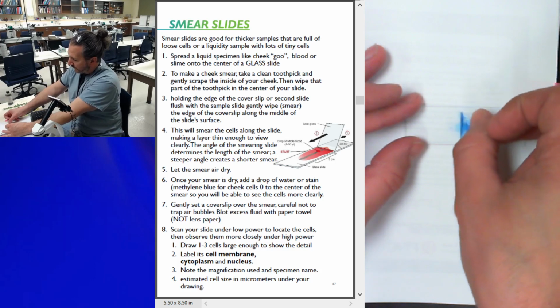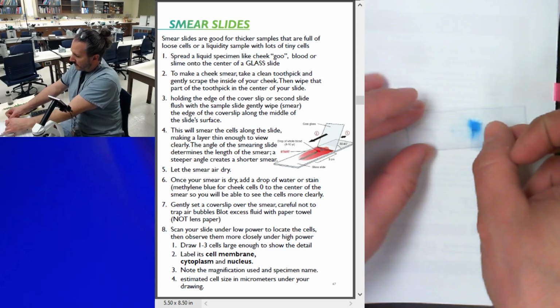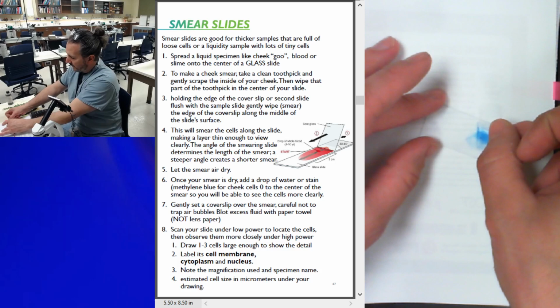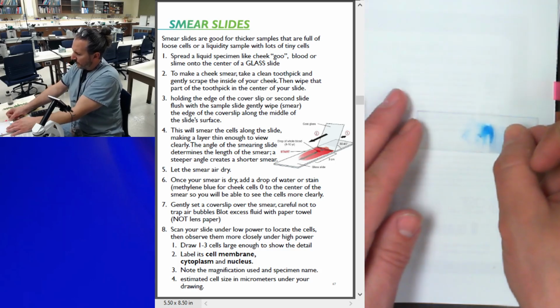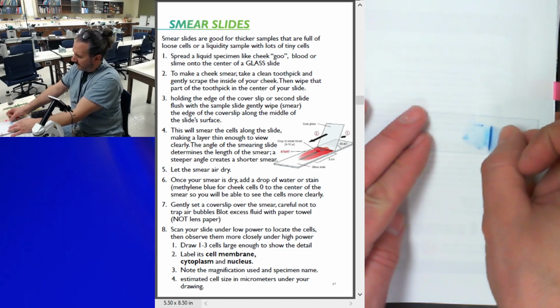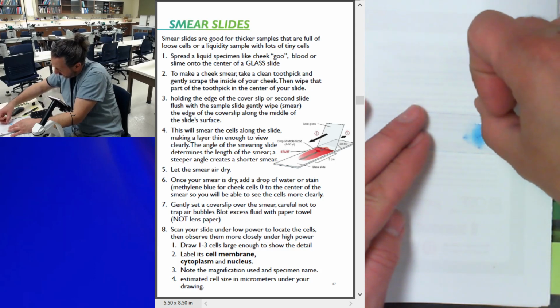If I had more tartar, I could have just dragged the bare tartar across and then stained it. But I didn't have a lot really to work with here. And if it's a really thin material, you can push back the other way. Drag it back, push it back. And I can see I have little tiny fragments to the side, so I'm going to push those in.